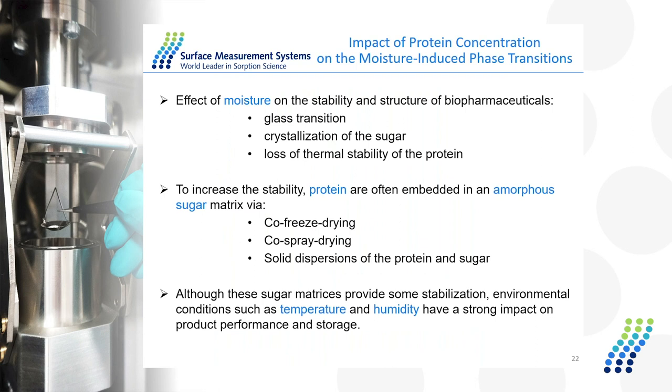So the case study for this application is the impact of protein concentration on the phase transition of protein and sugar formulations. In the development of solid state material, water has a very important role in the long-term stability, the activity, as well as the drug carrier interactions. To improve the stability of the protein samples, they are always mixed with some amorphous sugar by different methods like freeze drying or spray drying. And it's very important to study the sorption behavior of this protein sugar mixture to understand the interaction between different components, as well as to improve the formulation development for the final products.